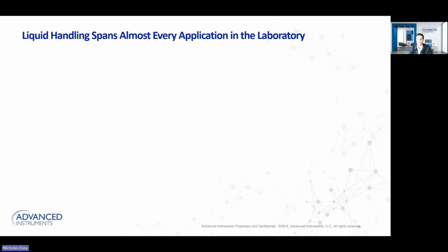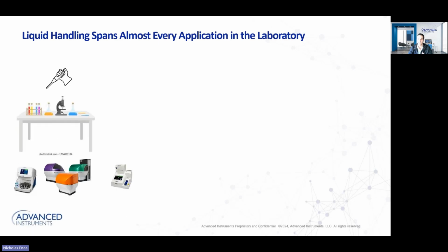Before we start on this, let's talk a little bit about liquid handling, right? I think of liquid handling as these big liquid handlers, but when I refer to liquid handling, I really refer to anything in a laboratory that involves liquid transfer, right? Essentially, this thing that this little animated hand is holding is a pipette. I think all of us have seen pipettes.